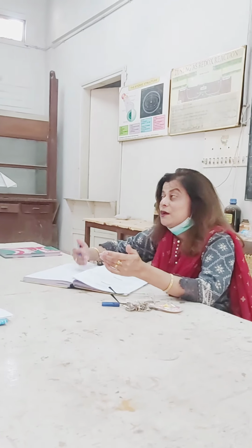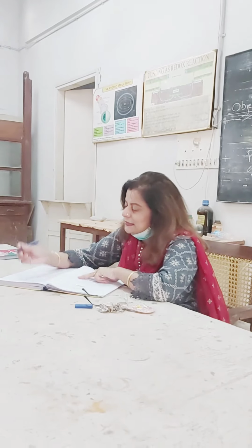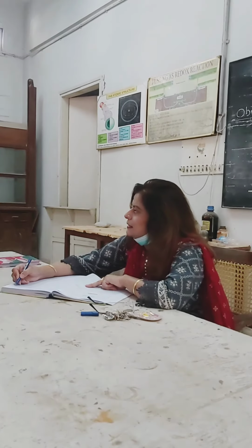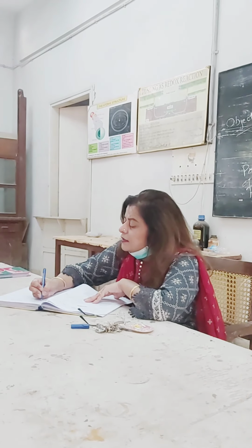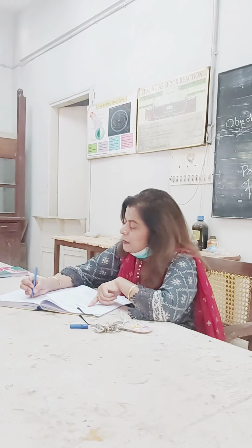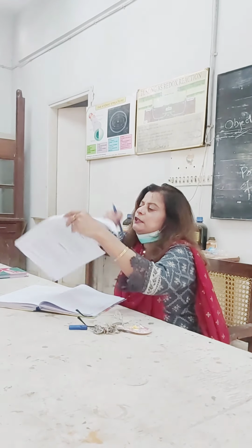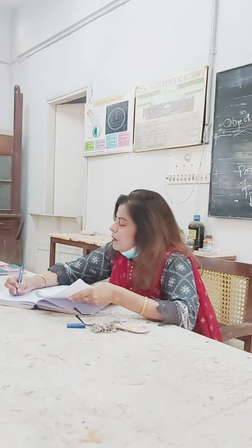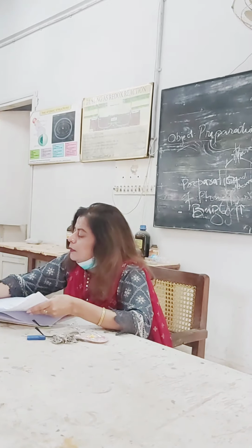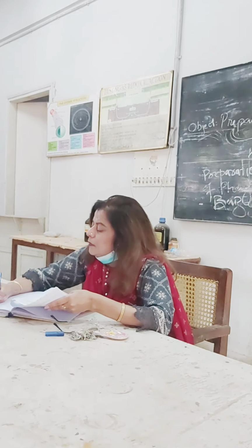You write everything, because you have to plan for each and every experiment and how you are planning, right? So in that sense, you are going to write down the heading, that is experiment, because this is simply a preparation. You are going to prepare an organic compound, right? So for that you will be needing a few things. So what would be the object? Object would remain the same, that is preparation of para-nitroacetanilide. I have chosen this experiment, that is preparation of para-nitroacetanilide from acetanilide.